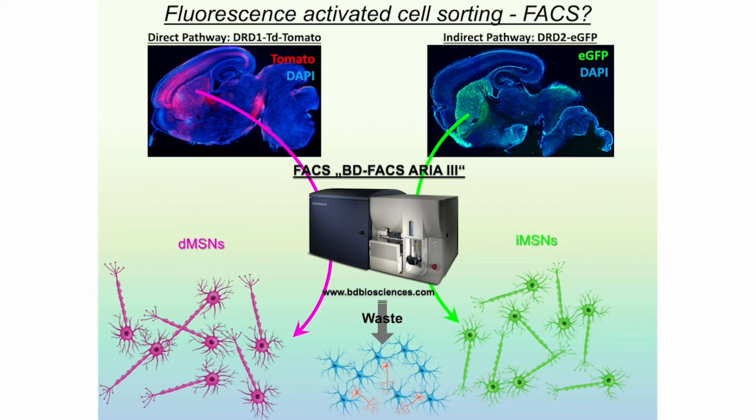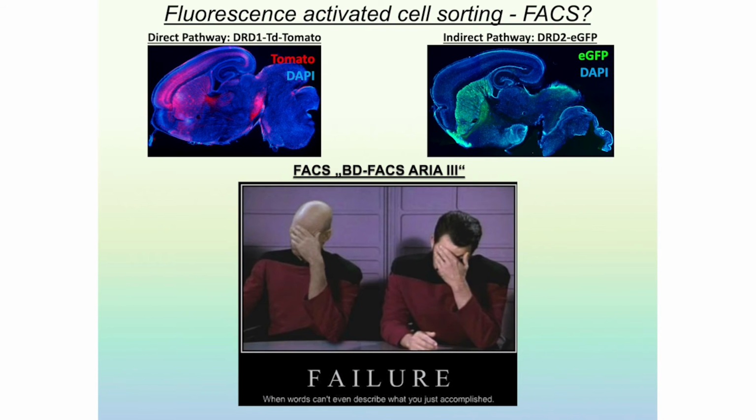And I thought it's a pretty good idea, and my supervisors somehow didn't really agree, as you might imagine, because I didn't know so much about FACS sorting. I just thought it's an interesting technique that enables purification of those neurons. But of course, we have several problems. So first of all, setting up a single cell suspension after dissecting the striatum, trypsinization and so on, standard procedure, takes quite a lot of time.